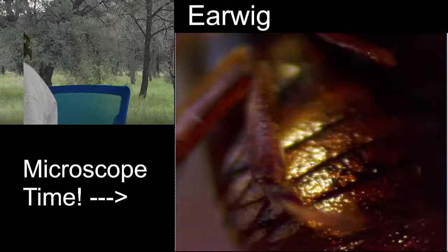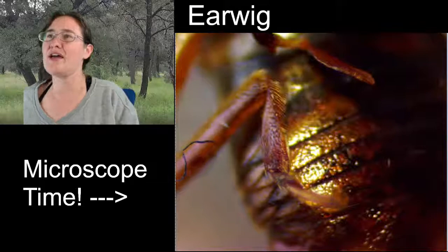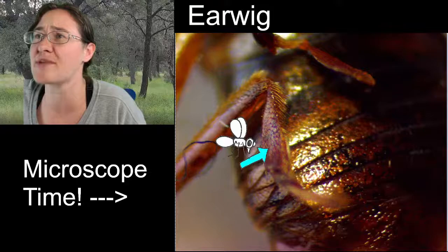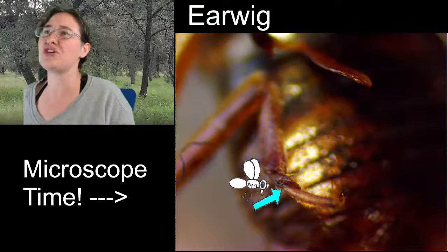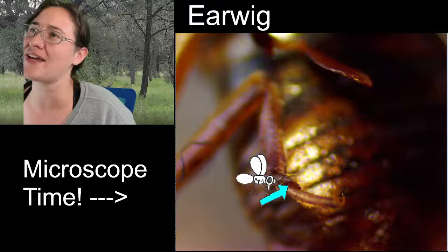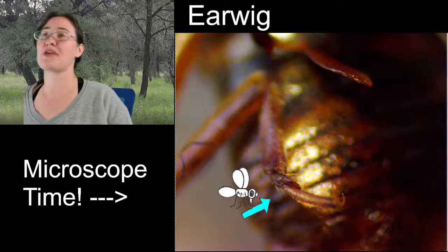I think that this is going to be our best for that. This is actually on our hind leg, but I wanted to be able to show you the characteristics. So this right here is the first tarsal segment, tarsal segment one. And then if we look at tarsal segment two, it has a little bit of a wing underneath the third segment. So you see how it could just end here, but instead it comes out a little bit, and then the third segment comes out. That's the characteristic that they're talking about. All Forficulids, or earwigs in this family, have that second tarsal segment that expands kind of underneath the third tarsal segment.